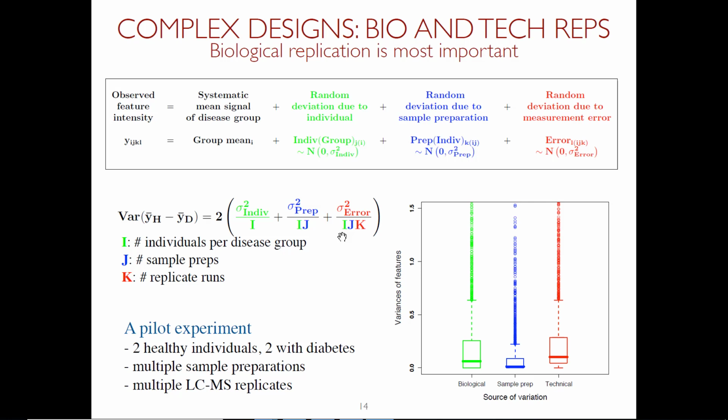So technical replicates then can be useful in the sense that you would not get the same peptides. You just actually get different analytes in different runs. But if in your mind you know that you have a very abundant analyte, you are likely to get it. You are likely to quantify it everywhere. Then multiple technical re-quantifications of that are not useful. But in terms of getting new analytes across multiple runs, there is a value in that for sure.